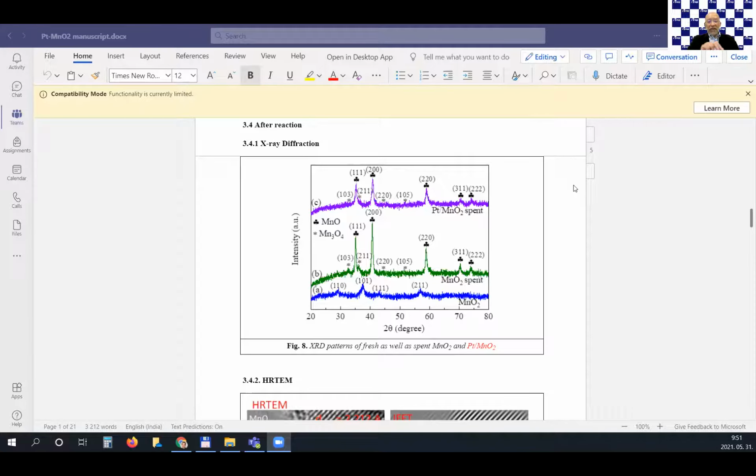So therefore, the small change of photoabsorption is a bit difficult to detect. For titania or the other metal oxide, for example, we use the detection light of wavelength about 625, the red light, and they originally have no red light absorption. So therefore, even if the absorption change is small, that is very, very sensitively detected. So this is one point.